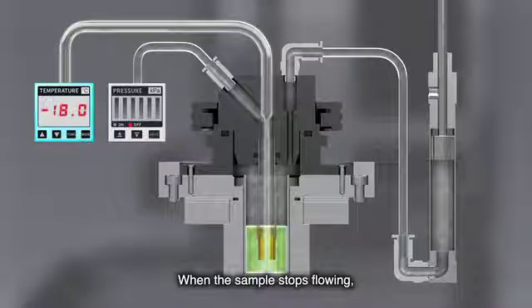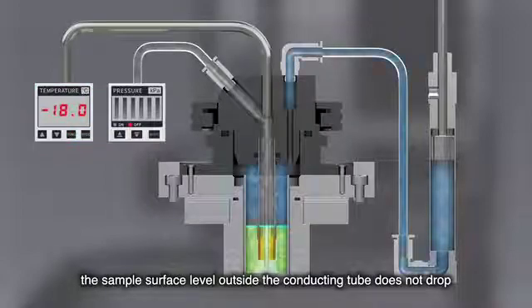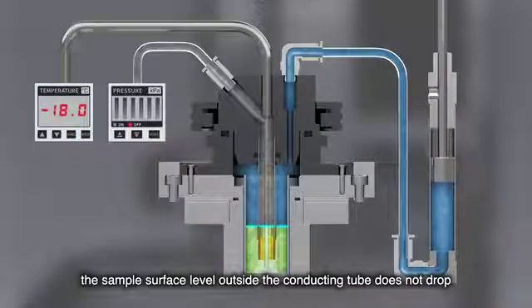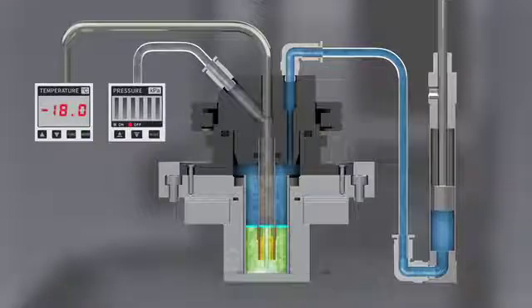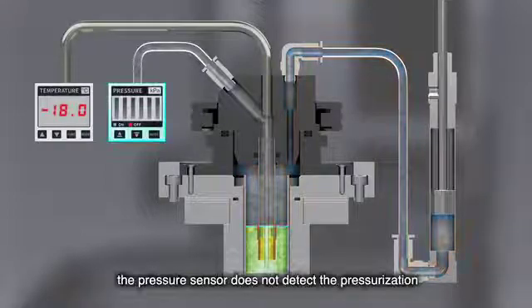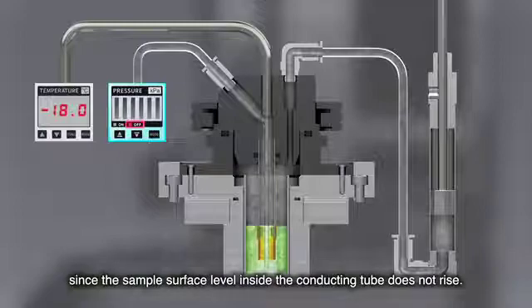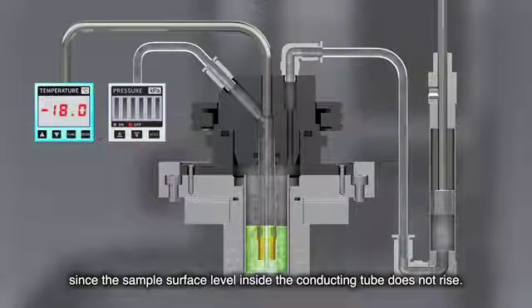When the sample stops flowing, the sample surface level outside the conducting tube does not drop even when pressurized. At the same time, the pressure sensor does not detect the pressurization, since the sample surface level inside the conducting tube does not rise.